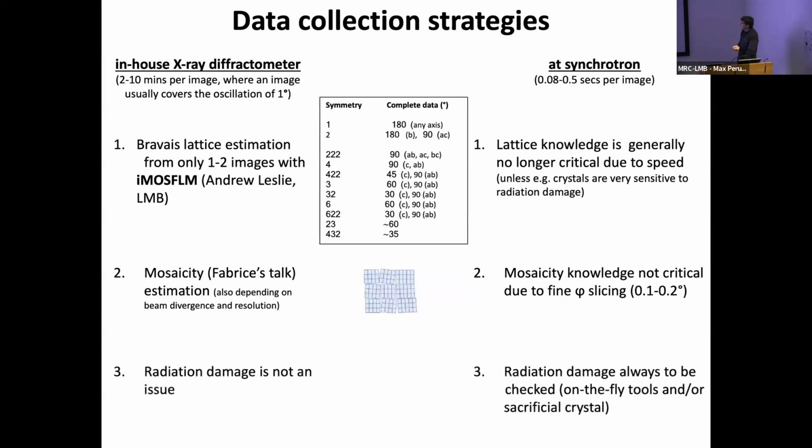But what is a problem at the synchrotron that is not a problem with the in-house source is the radiation damage.